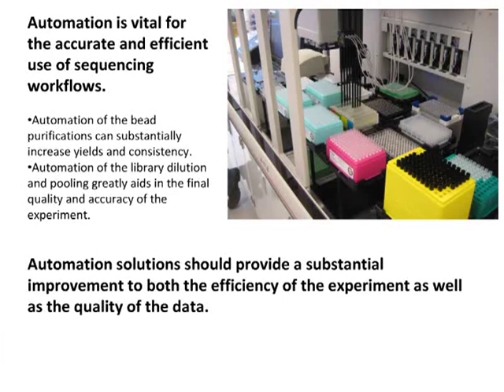But where we've really noticed the improvements that the automation brings is where different technicians can use the automated schemes, and we completely, largely, or essentially completely eliminate the bias or differences between different technicians operating the robot, since the robot provides that normalized workflow. Furthermore, it also provides traceability to the experiments, where if something does go wrong, using various tracking features in the Beckman software, you can get a better idea of it. If something looks funny at the end, it's often a bit easier to trace back compared to manual processes.